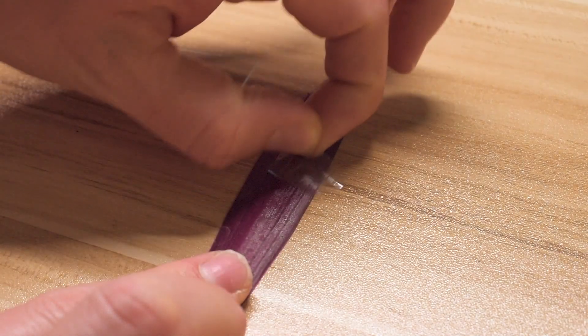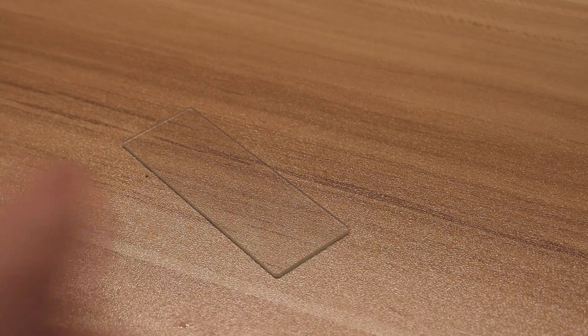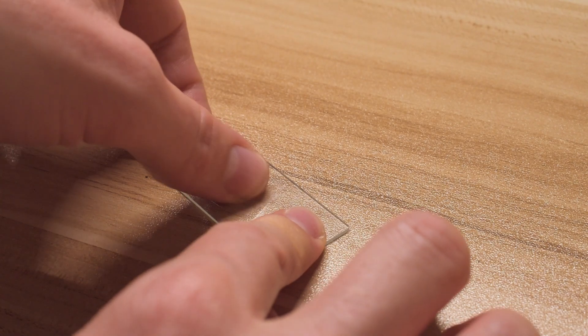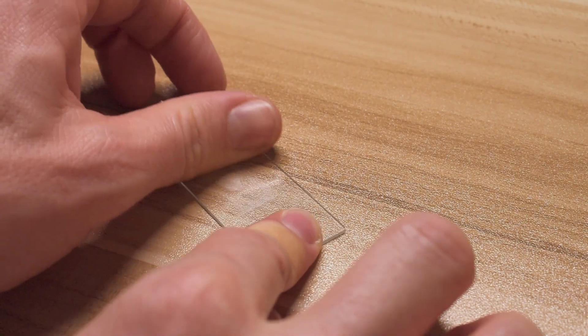Peel off the tape and the nail varnish will peel off with it. Put it on a microscope slide, and then look under the microscope.